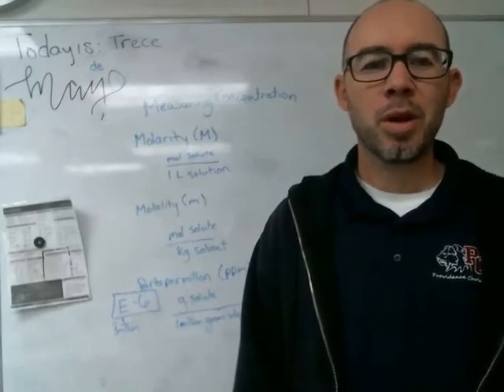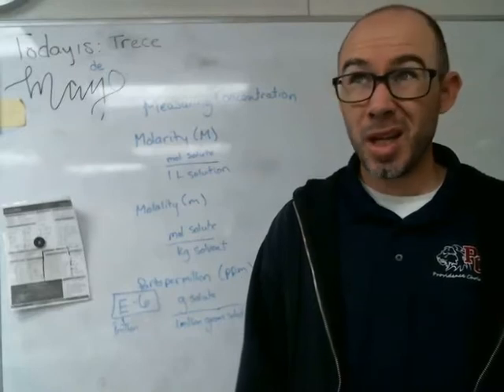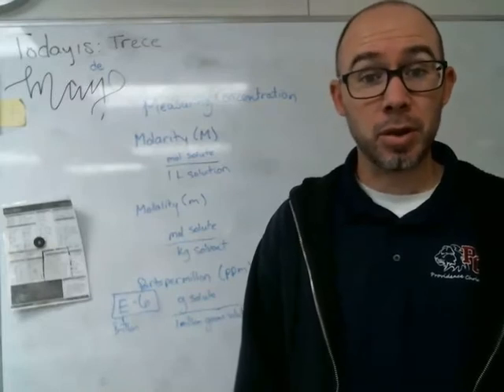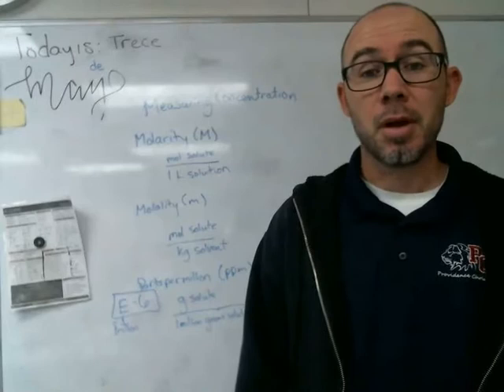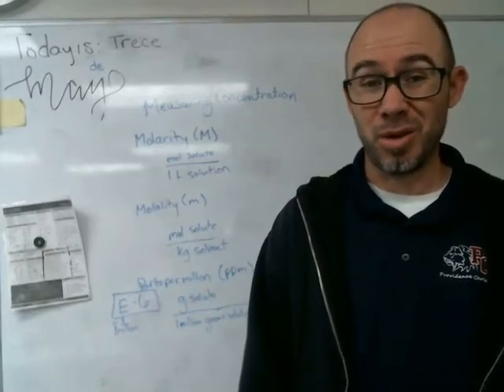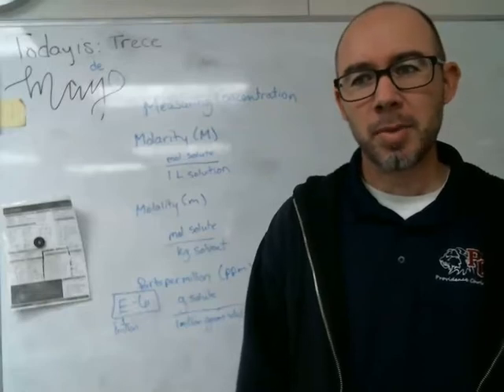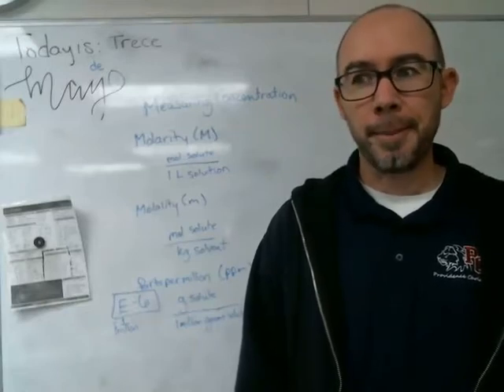I want to review really quickly, as you're looking at section 12, about measuring concentrations of solutions. Now, you know the saying, the solution to pollution is dilution, right? So I'll show you how that works when we set up these solutions for you to do in the lab.